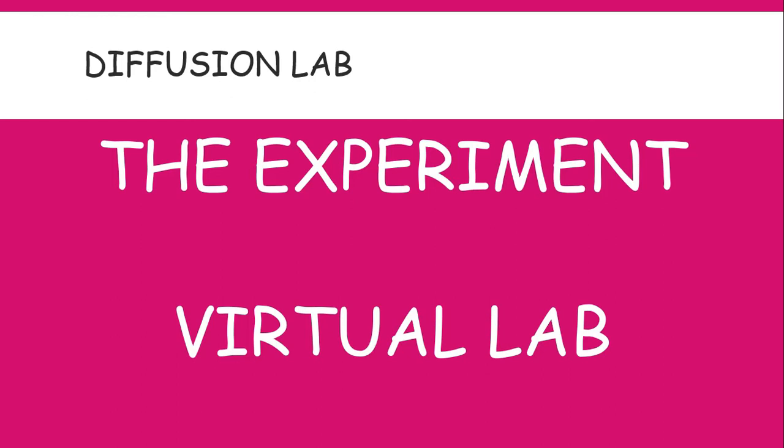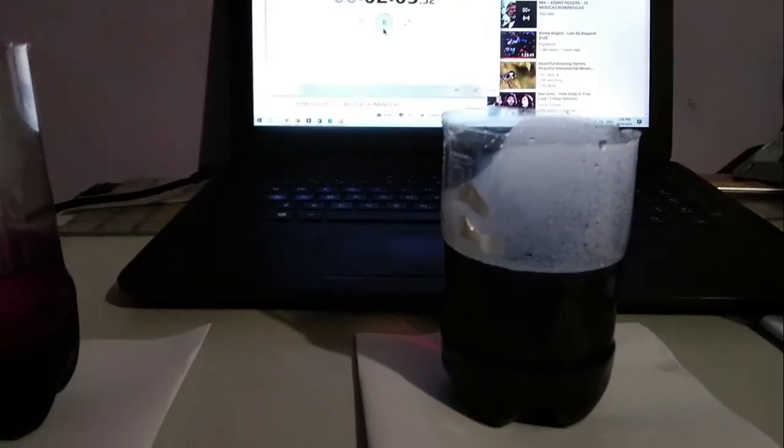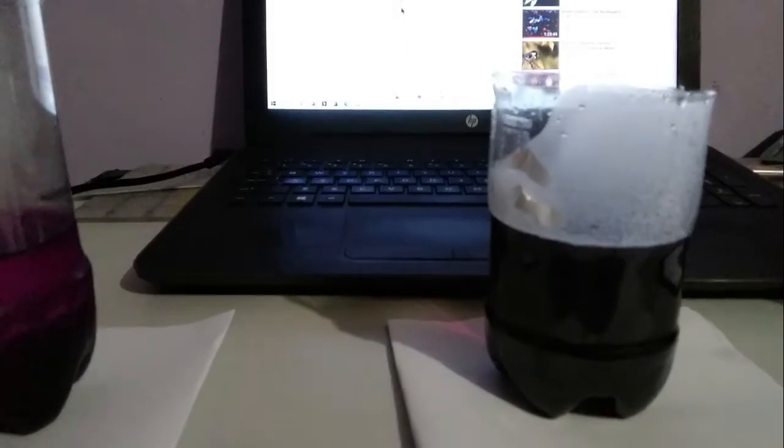If the observation is not clear, then your aim will be a problem, because you will not be able to write a good conclusion, neither will you be able to write a good discussion. Let's move on into the video. So we see that specimen B is totally purple, and that happened at 1 minute 33 seconds.